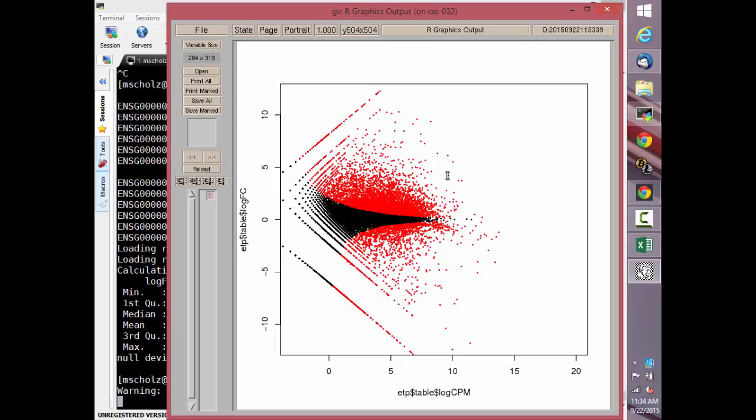Part of the reason is because we only have one sample for one of those two, so there are no error bars on those counts, which means that any of these that might have high variance aren't going to show up unless or until we get the lung counts in there. The more samples you run, the more discrete this is going to be. You also have to bear in mind that this is healthy tissue, lung versus saliva. How many genes do you really expect to be differentially expressed between lung tissue and salivary gland tissue? Almost all of them, right? So it's not surprising that you see a chart like this for the experiment that you're looking at. But it does look much cleaner.